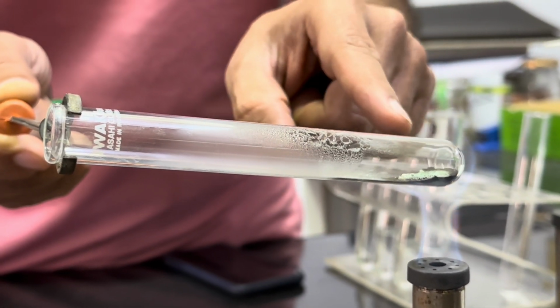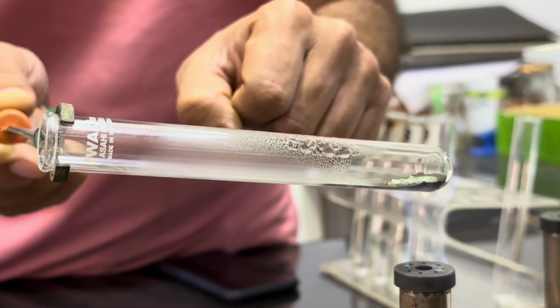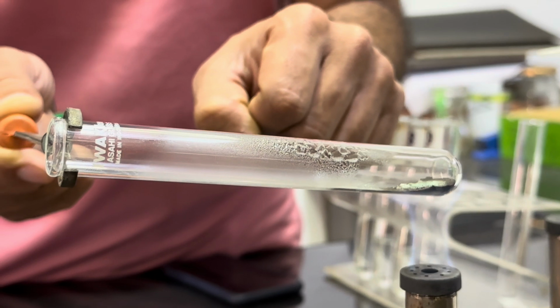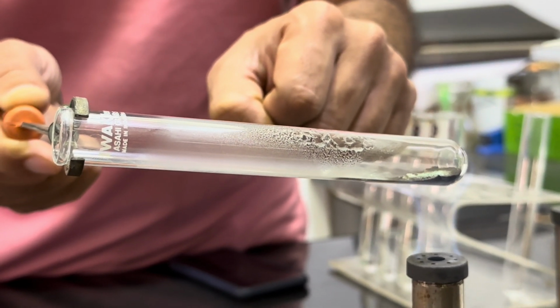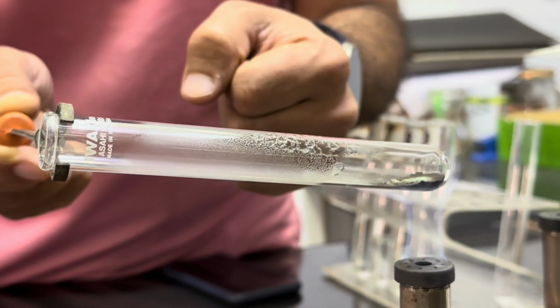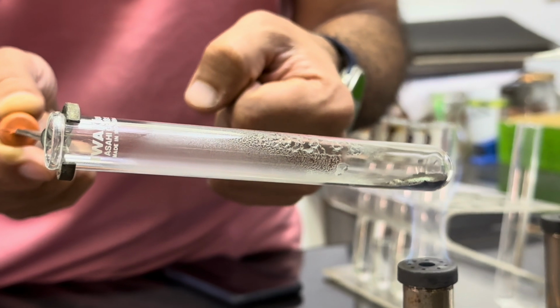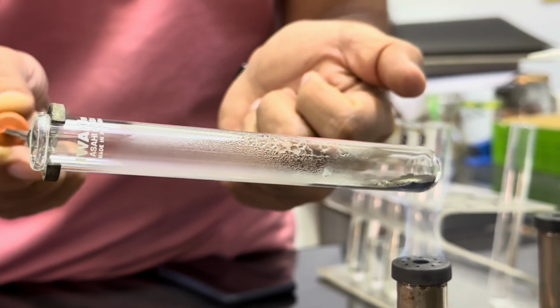And now we will see what is happening to the solid. Solid is showing a bit of spitting, and also it is changing its color from green. It is turning into gray and then black from the corners also. So let's completely heat this green solid and we'll see if there is any permanent color change for all the solid happening or not.